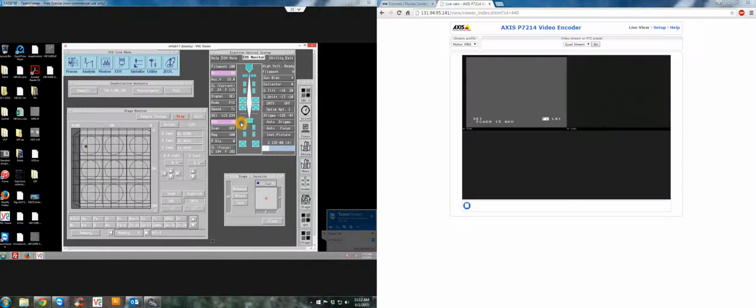So what I want you to do is, over here on the EOS monitor, turn on the scan generator and open the Faraday cup. This opens it, and now the beam is striking your sample or standard or wherever you are. In between use, you can close the Faraday cup, but in this case, let's leave it open.